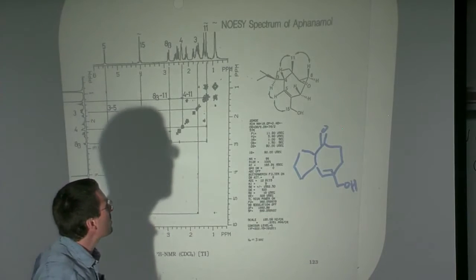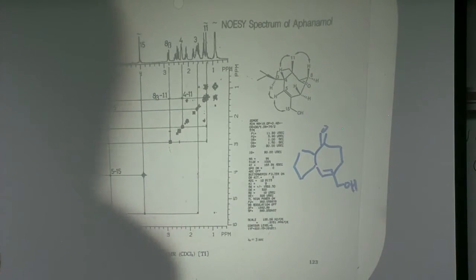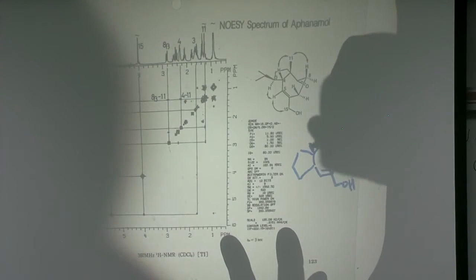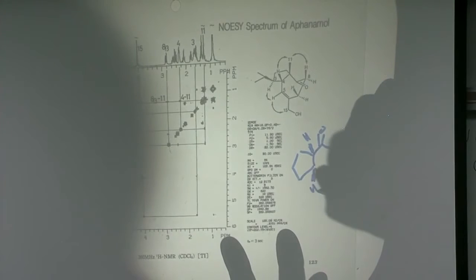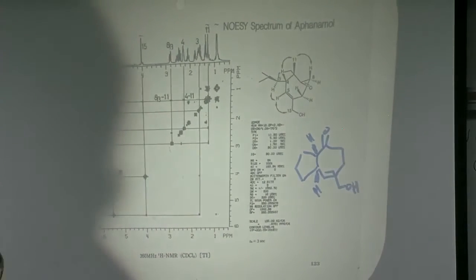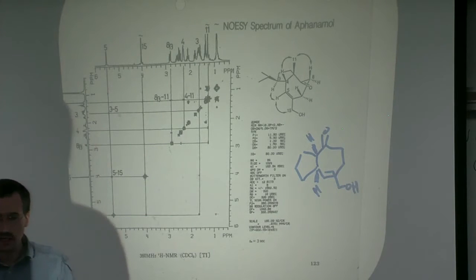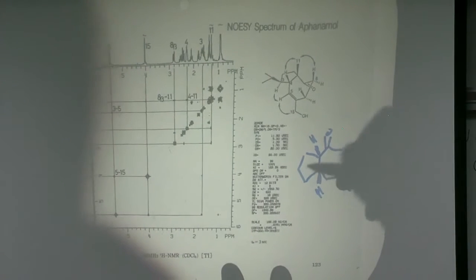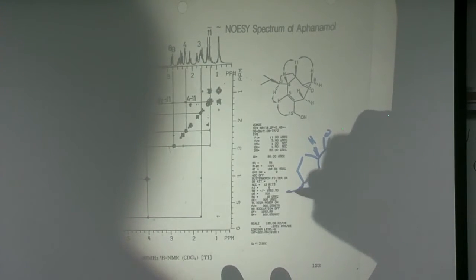And of course you have some stereochemical issues because you have a ring junction in the molecule. I'll tell you now the ring junction is cis. But of course you'll want to be able to tell that because you wouldn't necessarily know that. And there's an isopropyl group, and the isopropyl group is cis to the hydrogens of the ring junction.